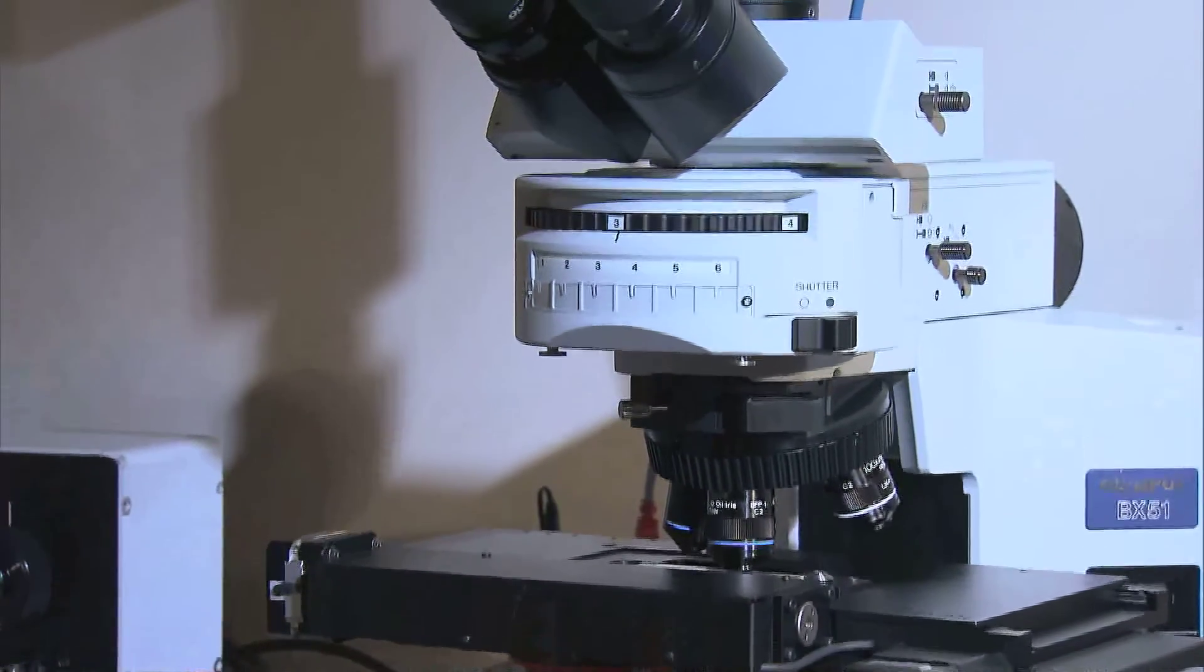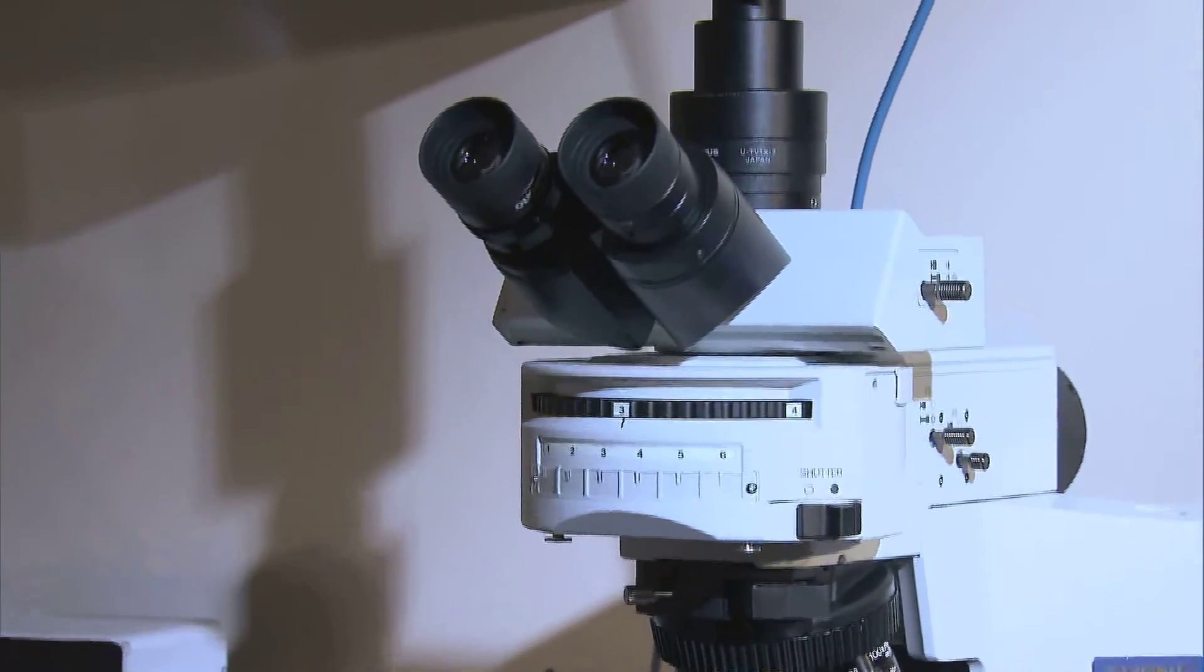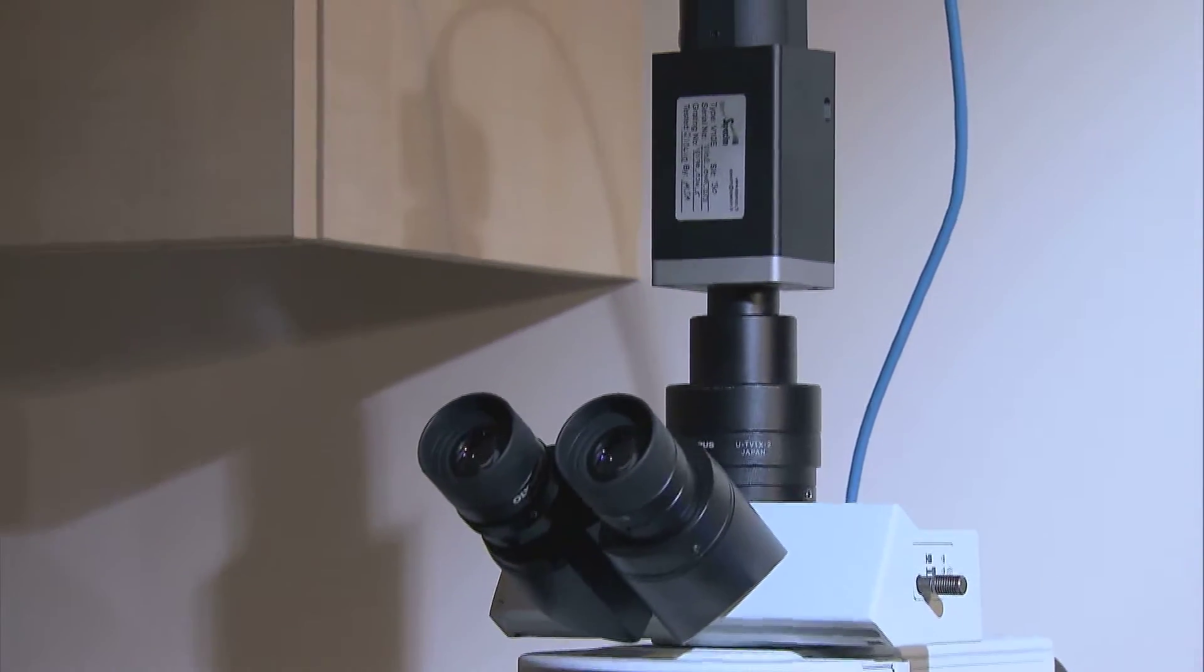CytoViva's technology combines a high signal-to-noise optical microscope with an integrated hyperspectral imaging system.